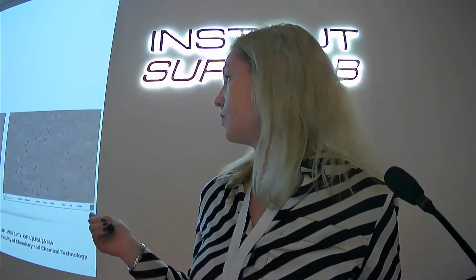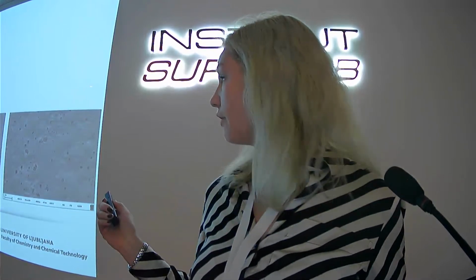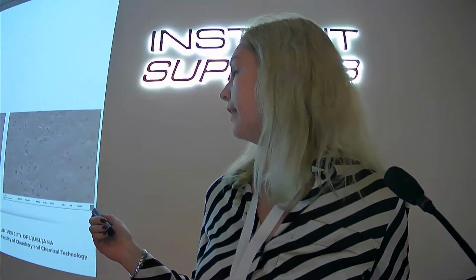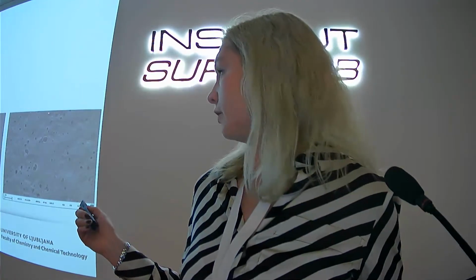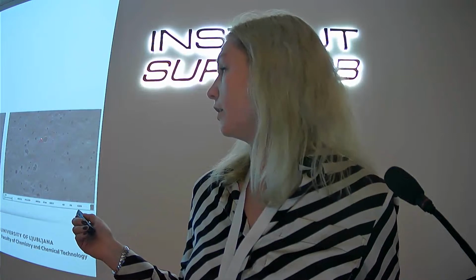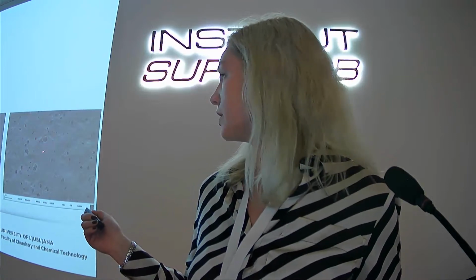And in this case, this was biodegradable PBAT after UV aging and then a biodegradability test, so also exposing microplastics to microorganisms. Microorganisms start to degrade these particles, and you can see here these holes were not present before, when we were observing the pristine particles.